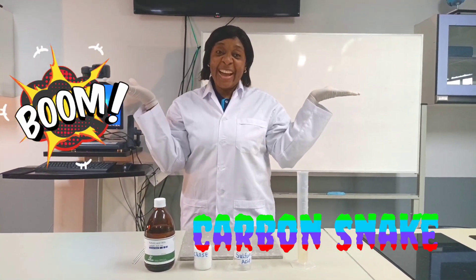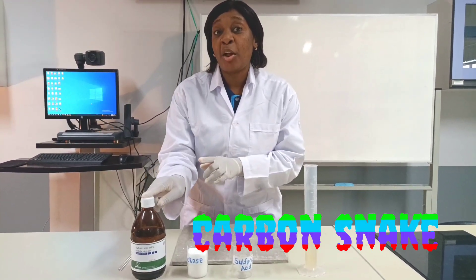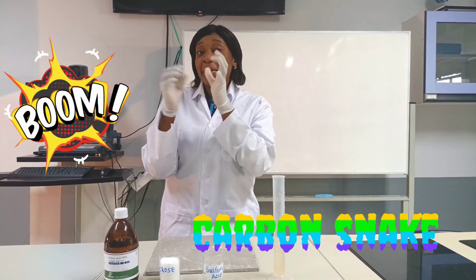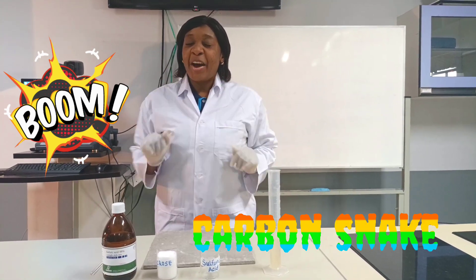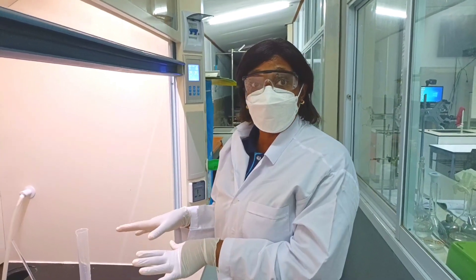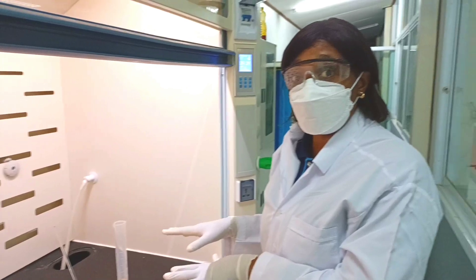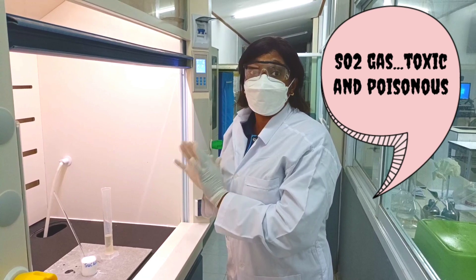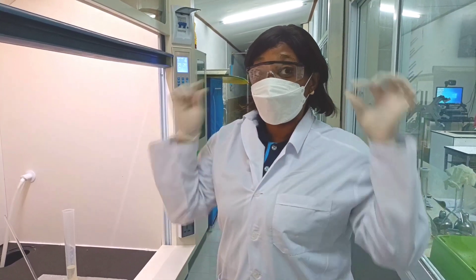Take note: sulfuric acid is very corrosive, which is why we have to wear gloves to protect our hands. I am doing this experiment in a fume cupboard because it produces a very toxic gas — sulfur dioxide gas.